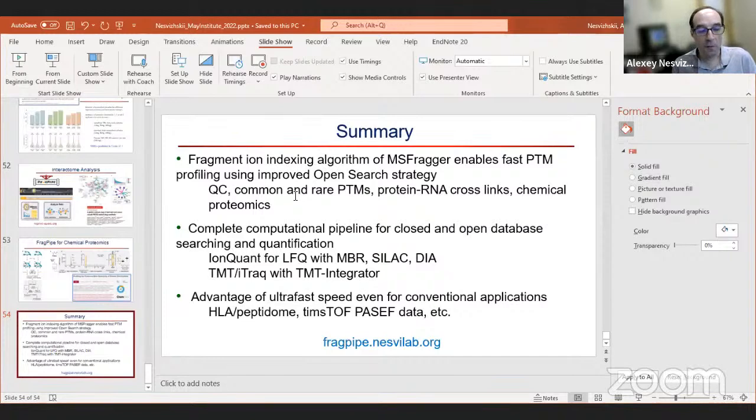But a lot of what was not identified was just noise. These days, I would say we're getting closer to 30, 40% of spectra that can be identified in a regular search, maybe 30% when looking for common modifications like oxidation and so on.